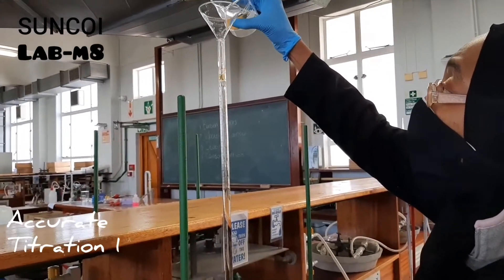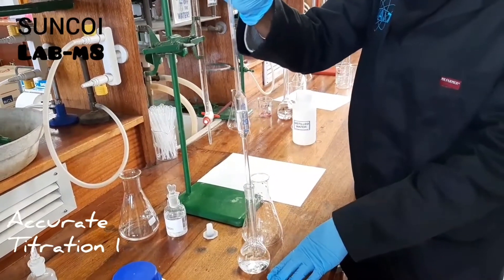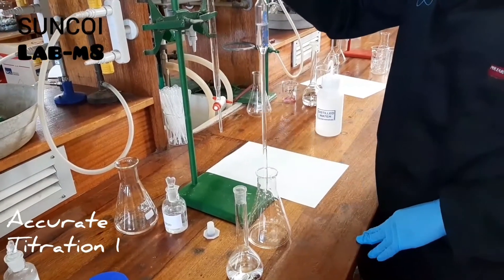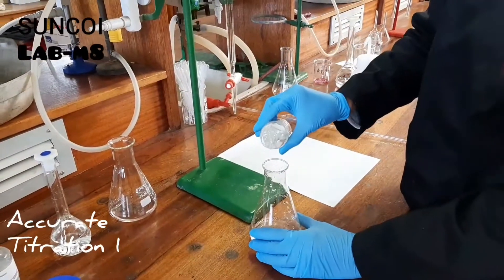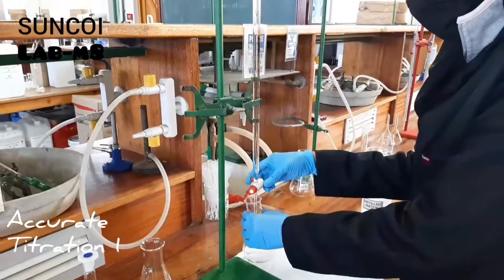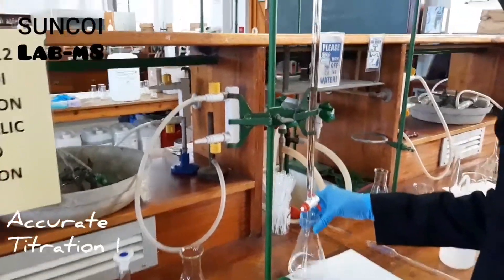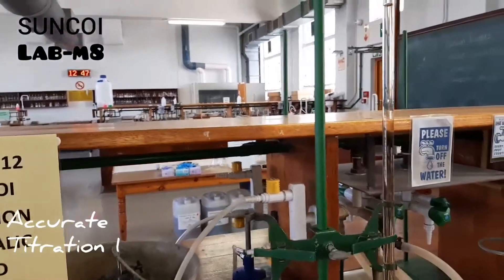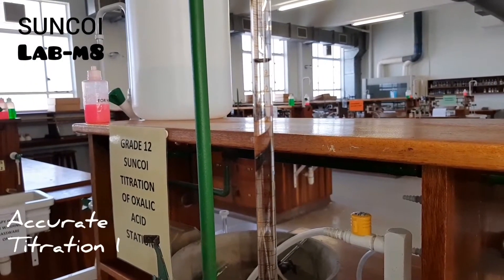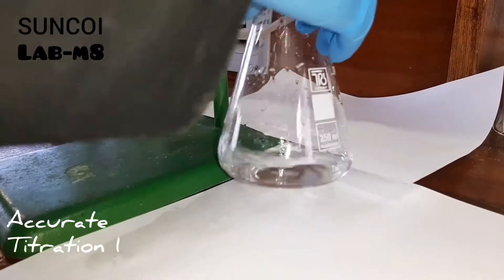Now we are ready for accurate titration one. Nusrat is filling up the burette again with NaOH solution, she is adding 20 ml of oxalic acid to the conical flask again, and then she will add two to three drops of indicator. You can't add more than that because then the color at your end point will be too pink. Now we've started the titration, and again this video is twice the speed. Now your end point is around a certain area, so you're going to slow down when you get close to that area — which is what Nusrat has done — and now she'll go drop by drop until we observe the end point.